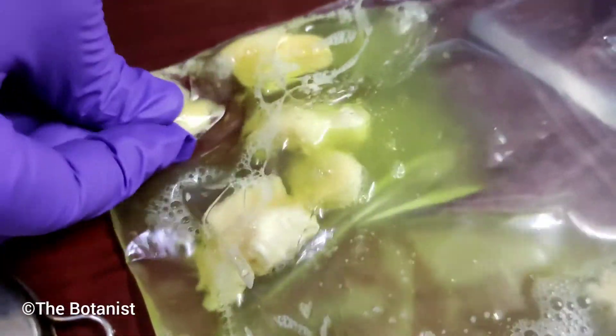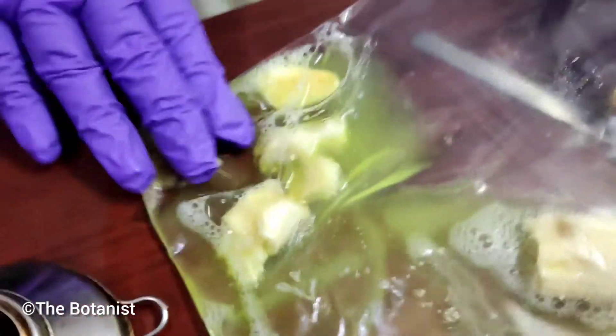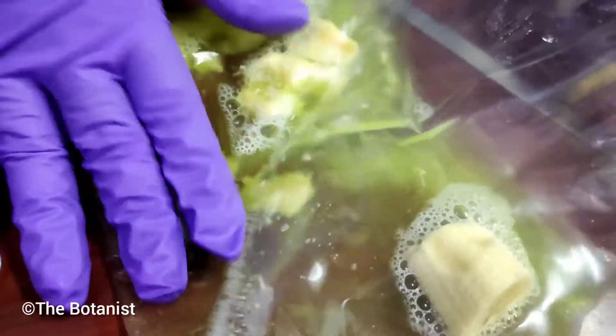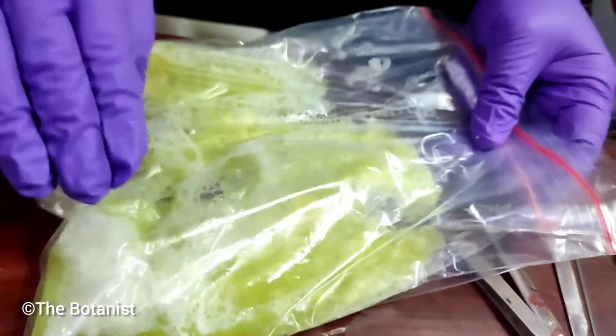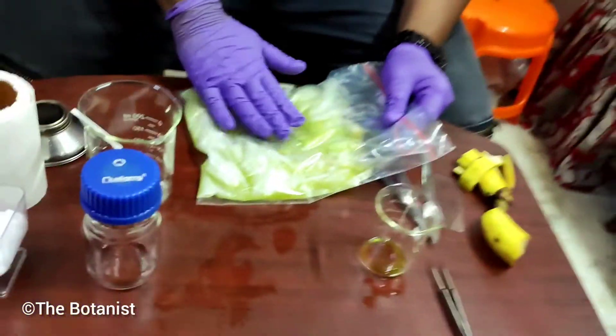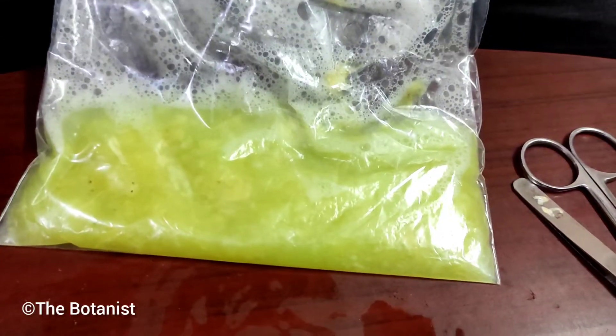We smash and mix the banana well with the soap and salt solution to break the membrane structure and to release the DNA. The solution is ready — now we have to separate the dissolved part.